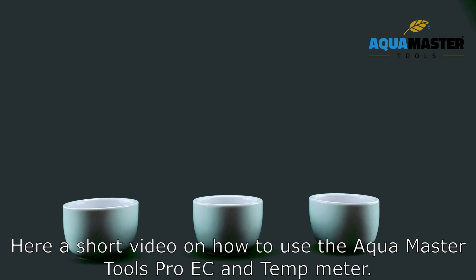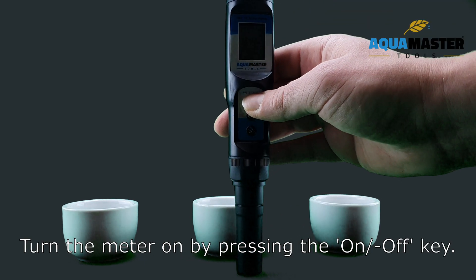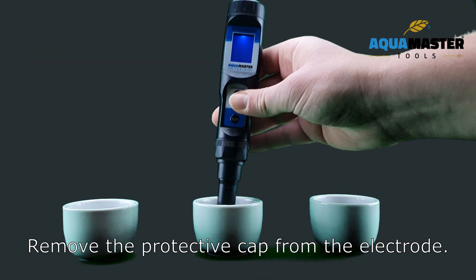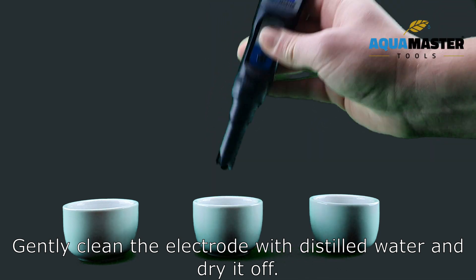Here is a short video on how to use the Aquamaster Tools Pro EC and temp meter. Turn the meter on by pressing the on-off key. Remove the protective cap from the electrode. Gently clean the electrode with distilled water and dry it off.